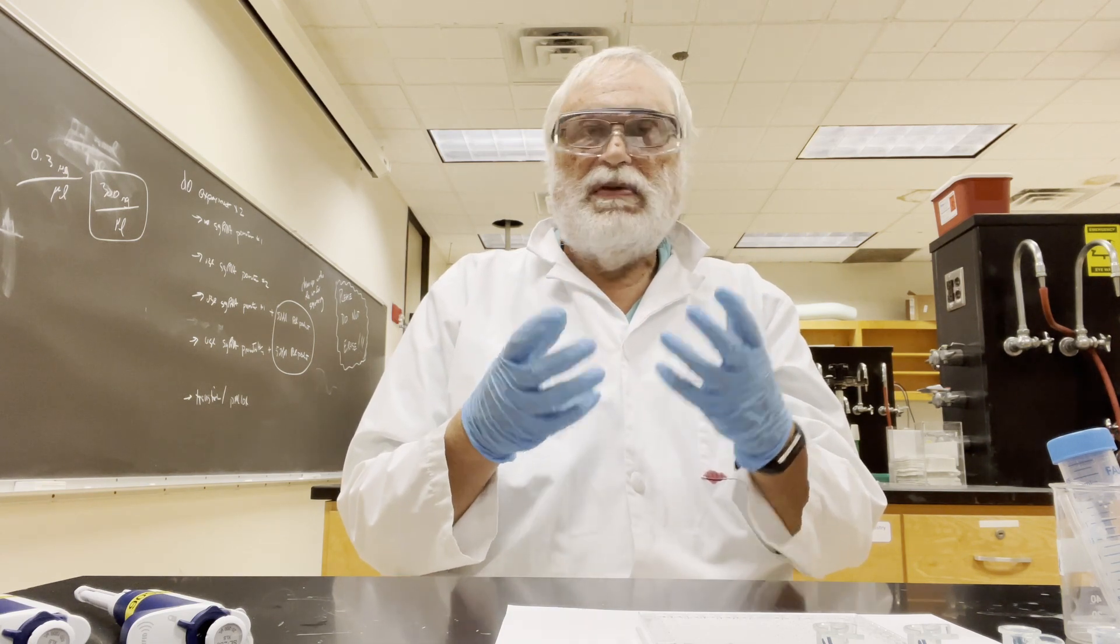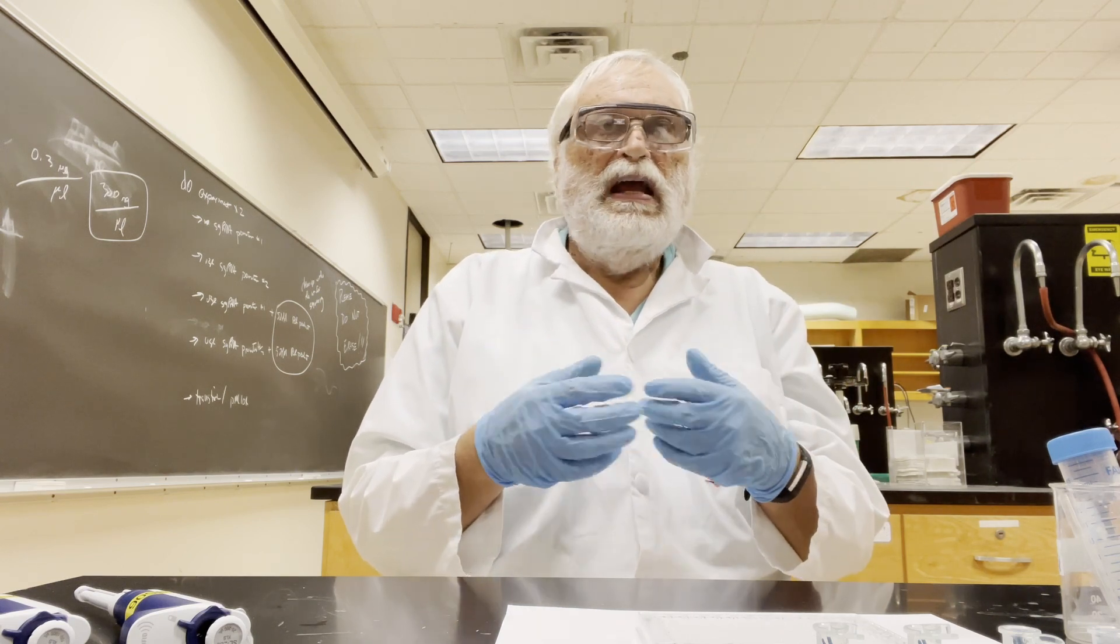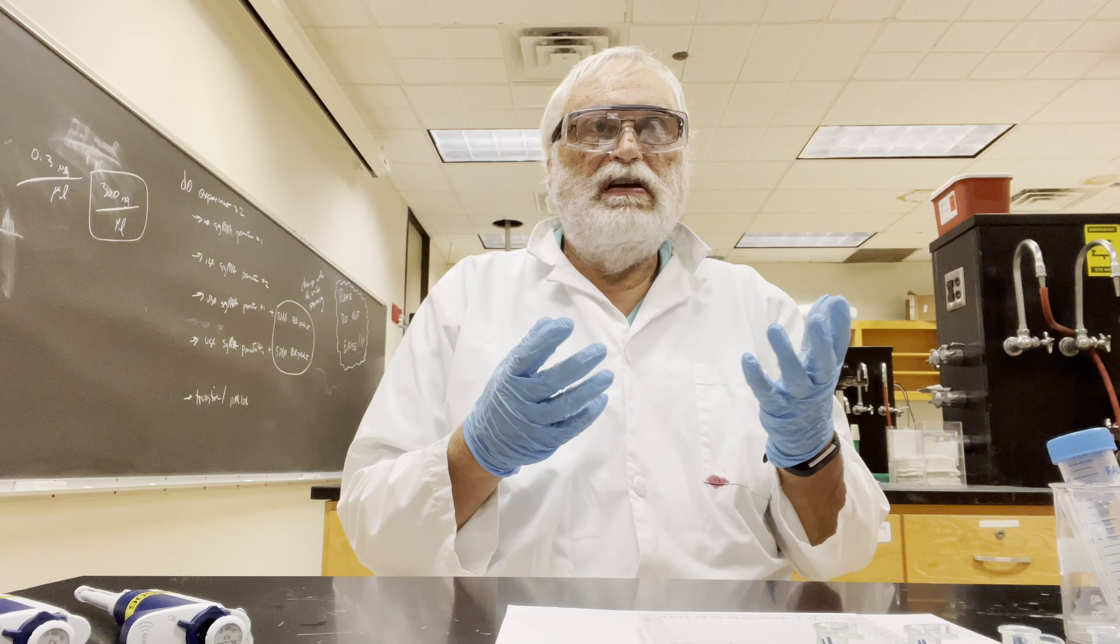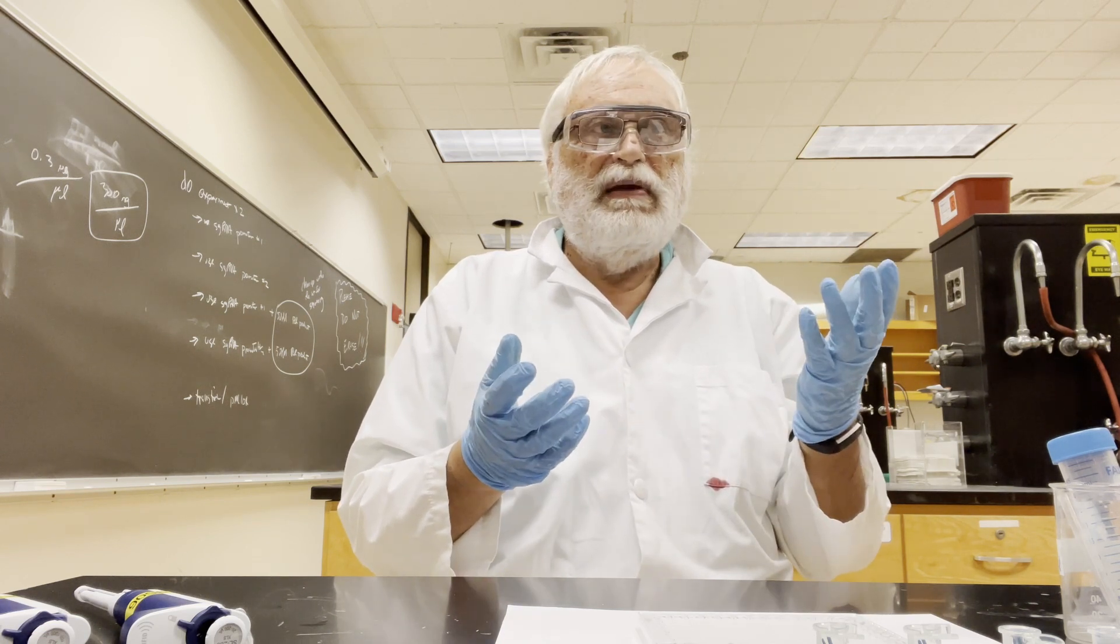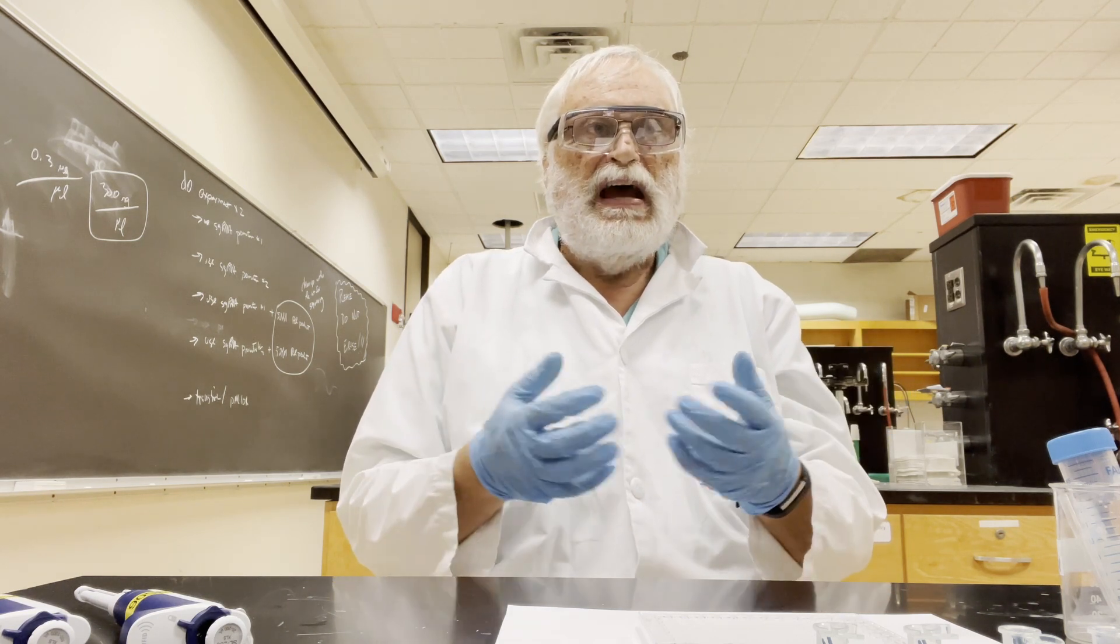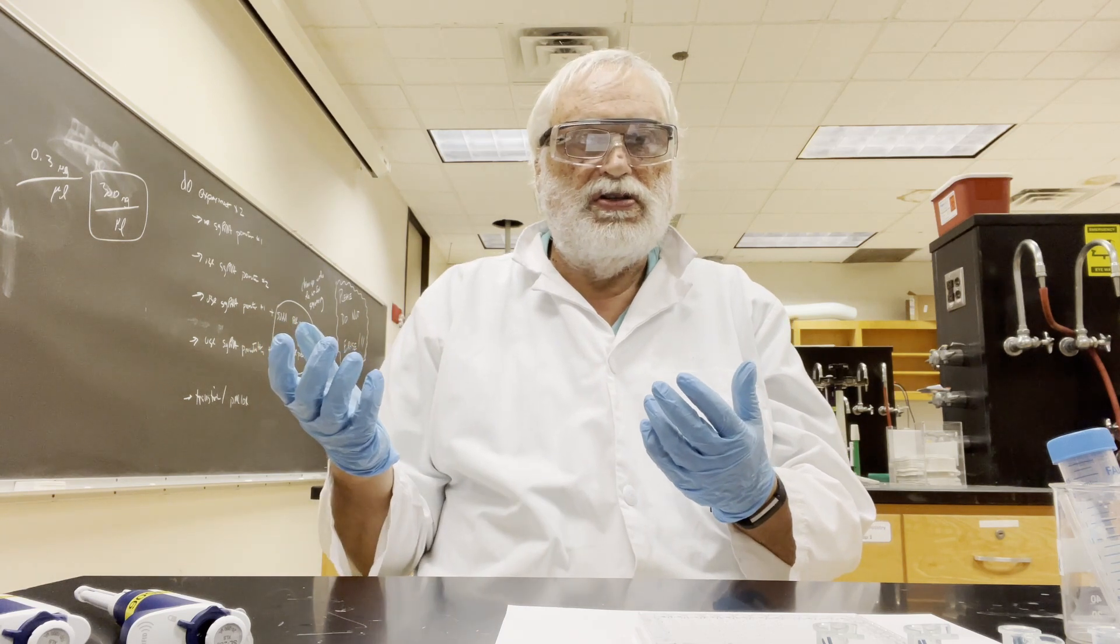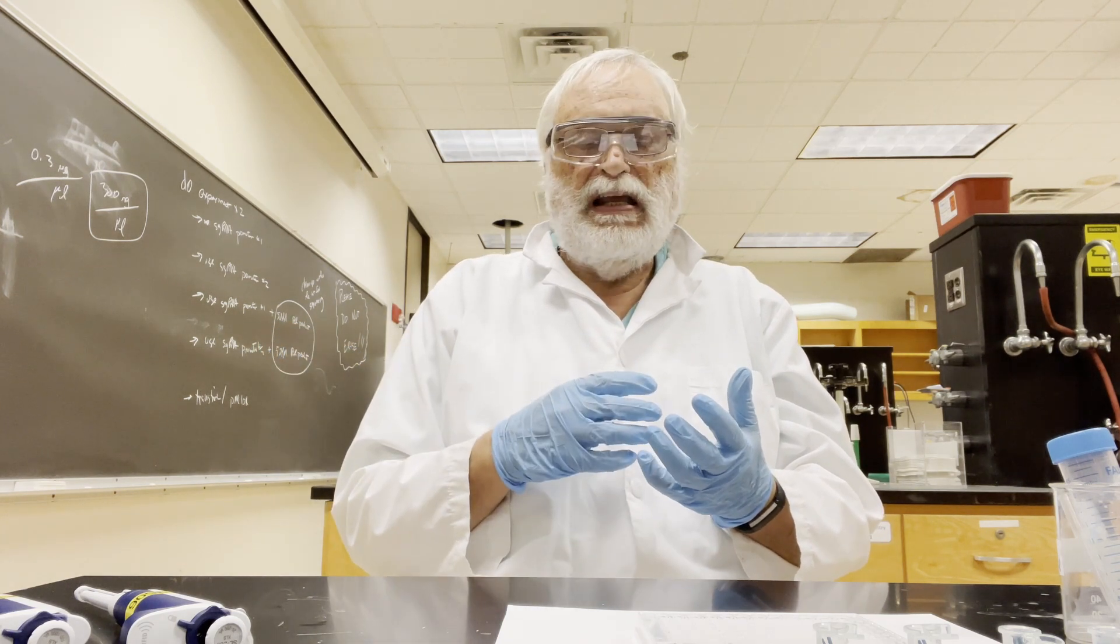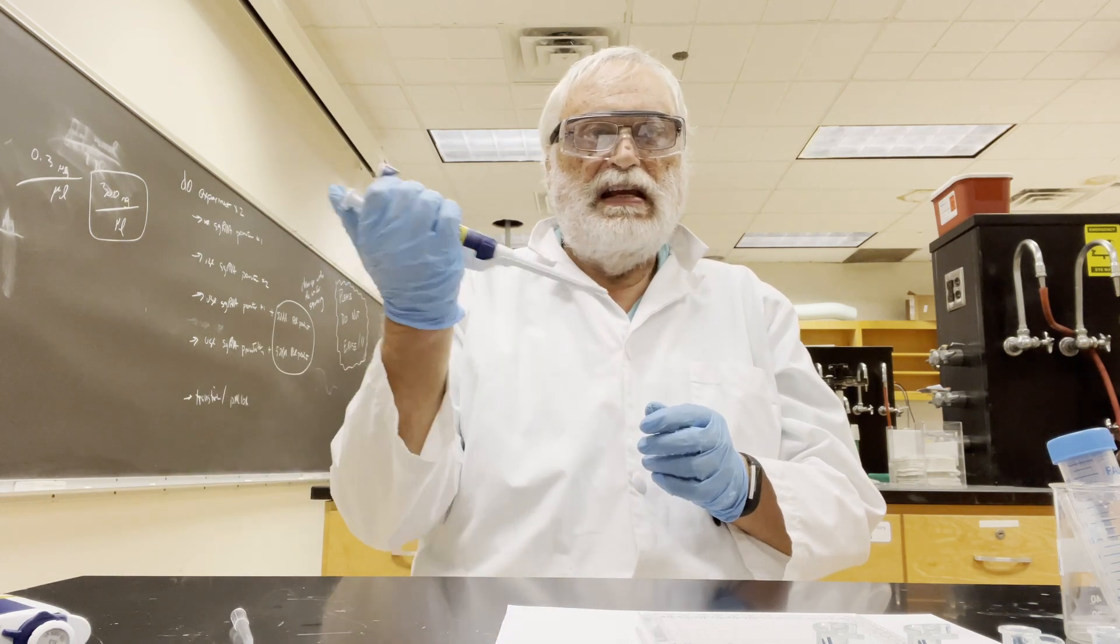These serial dilutions are something we do in the lab. We generate standard curves frequently during this semester and you'll probably do the serial dilution at least 50% of the experiments, and a number of times you'll be doing at least two different kinds of serial dilutions. So it's an important technique and doing this visually verifies your technique on using pipettes.